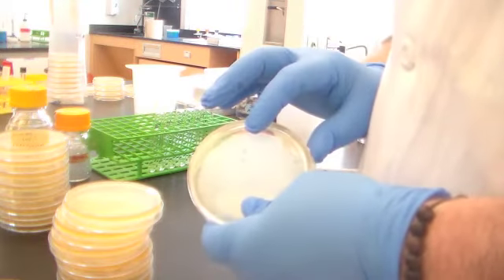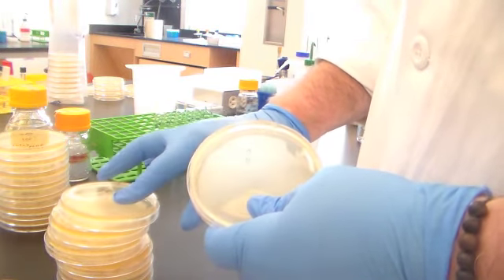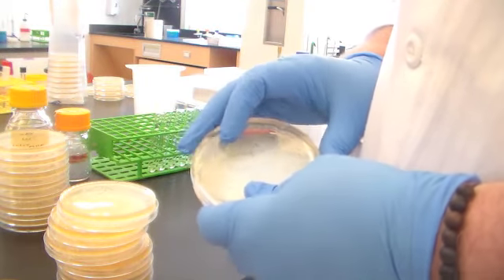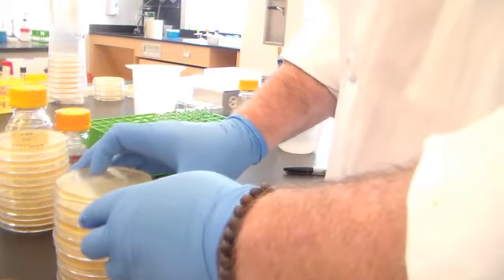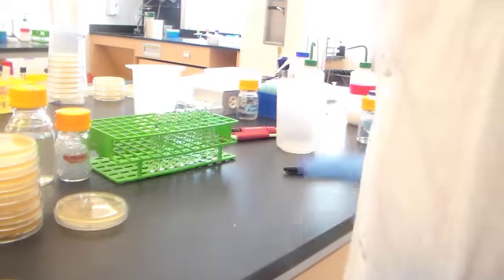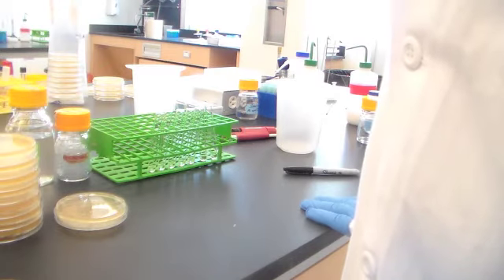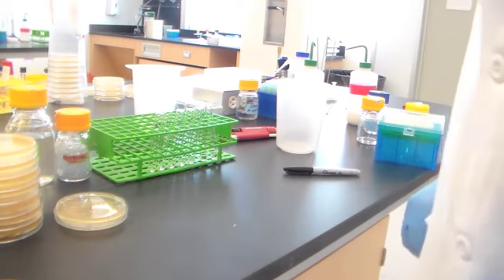For your time points, you're only going to go as far as 10 to the minus 7. This was an overnight culture that had grown to high density. So I suspect that in this minimal media with glucose or glucose and lactose, the bacterial numbers are not going to reach quite this high number. So I suspect that the 10 to the minus 7 dilution will be sufficient. Okay, I hope that helps clear things up in your mind as to what we're going to do in the lab. We'll talk more about the actual mechanism, as we have in lecture, of dilutions and viable cell counts. But hopefully this helps, and I'll see you in lab.